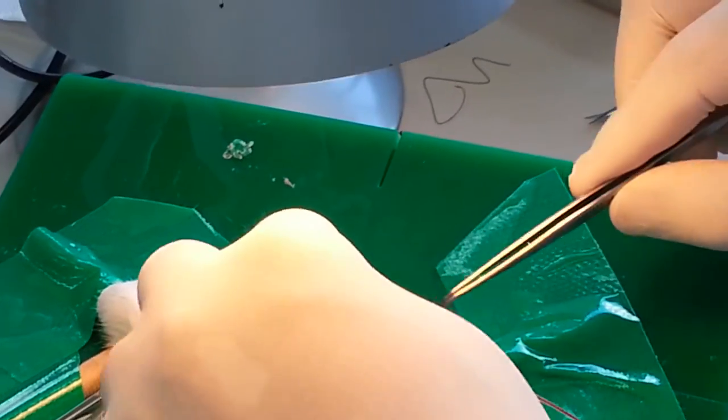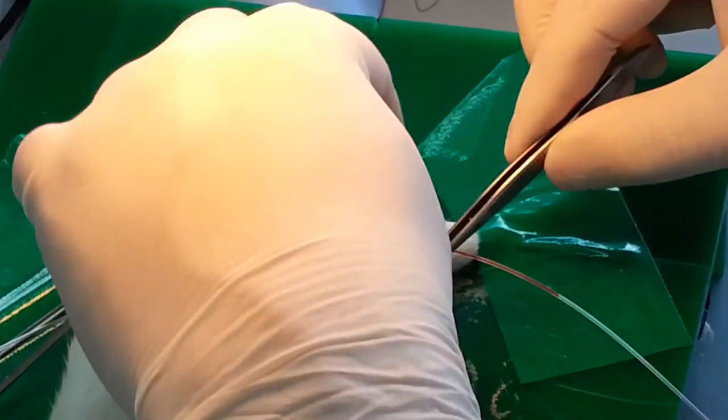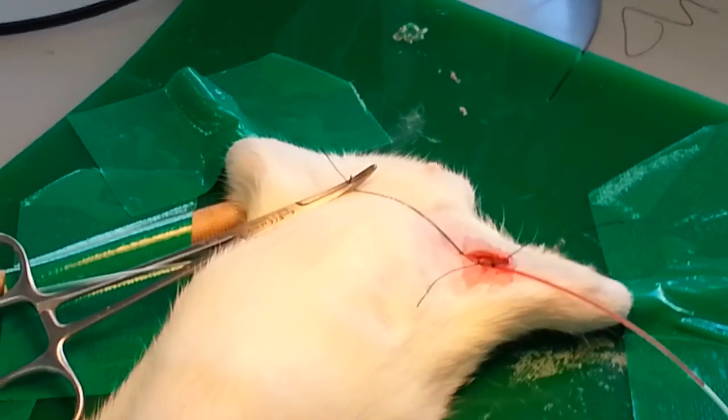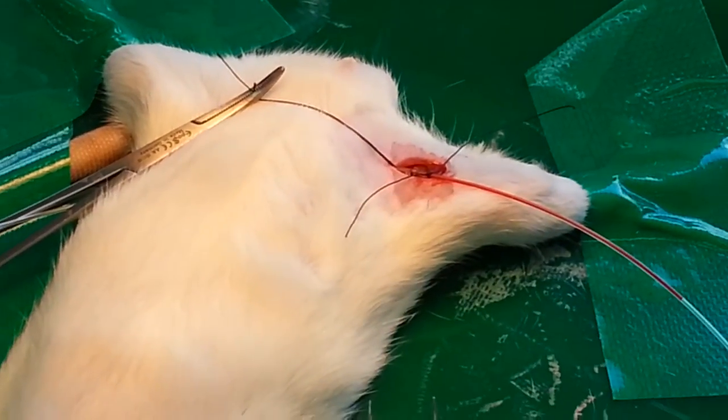We will tie this one to make sure that our tube is in a better position and is fixed. Our main work is done — we cannot open it yet because if we do the fluid will come out.